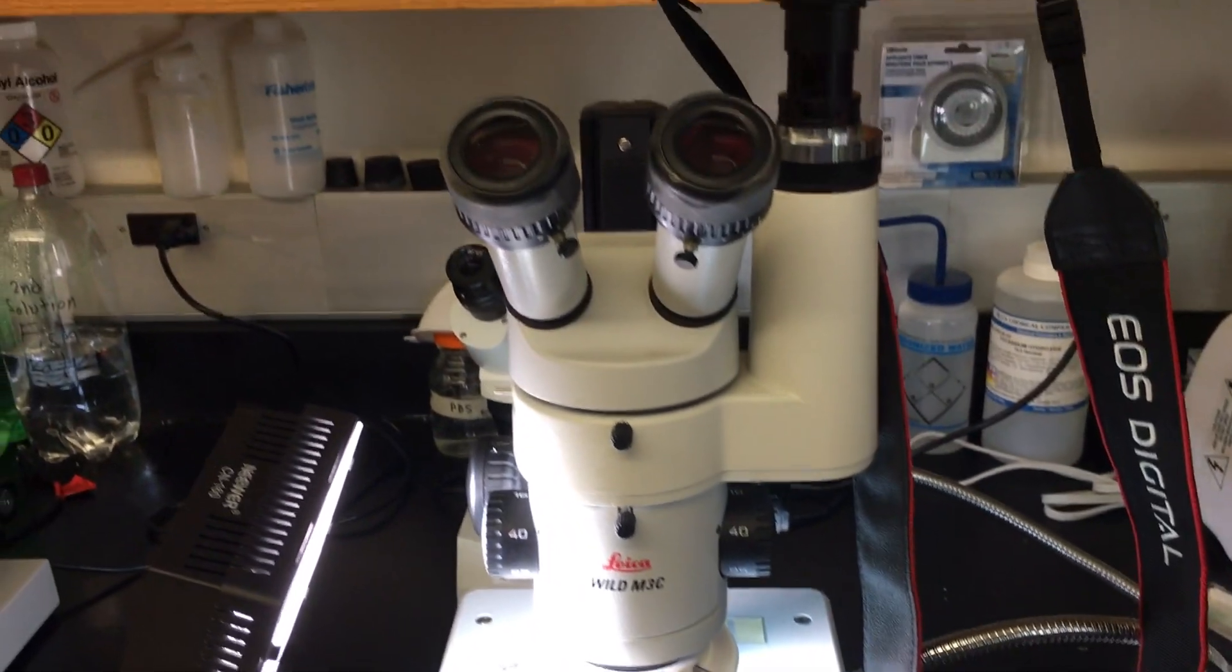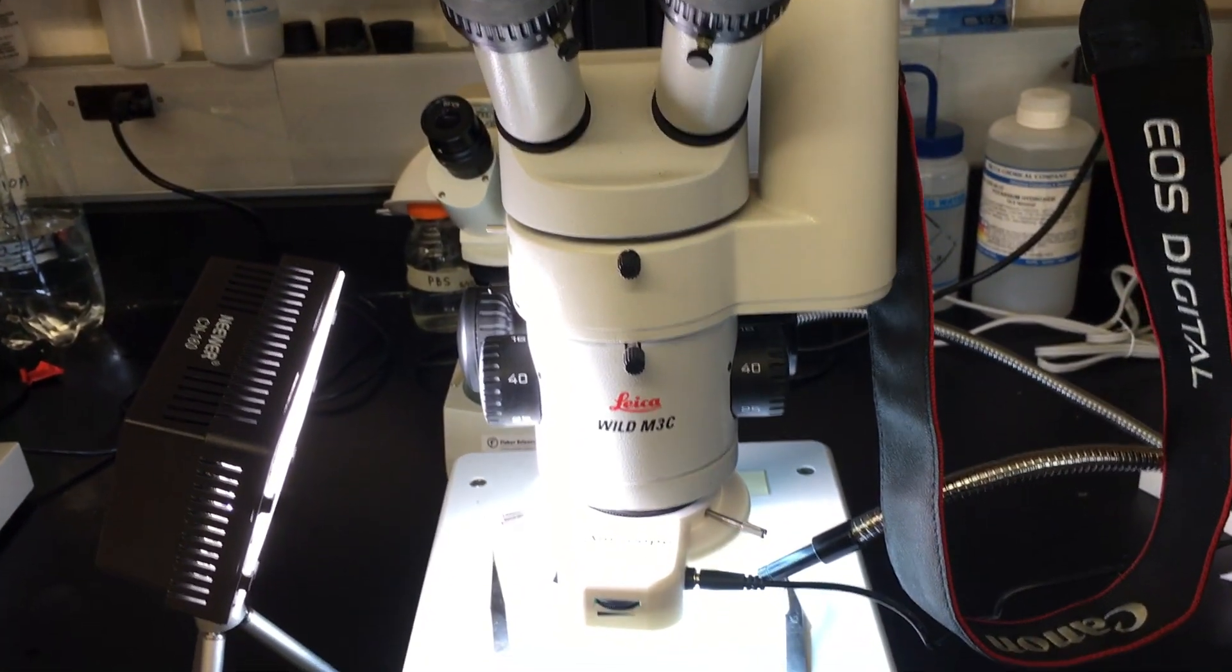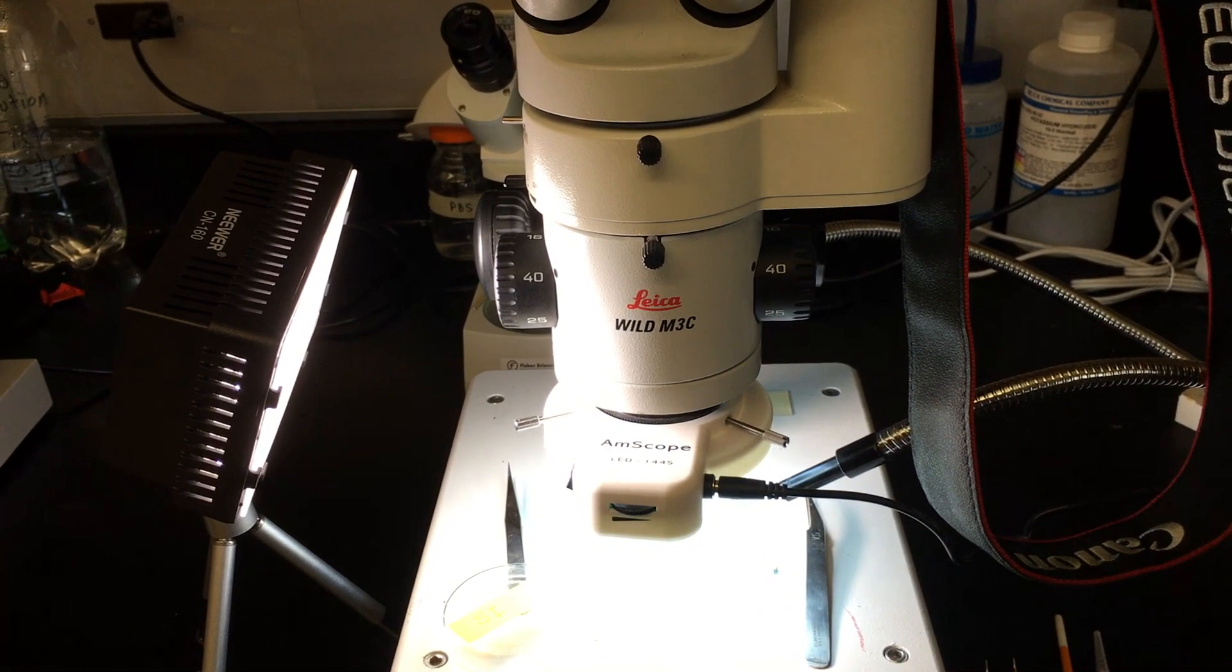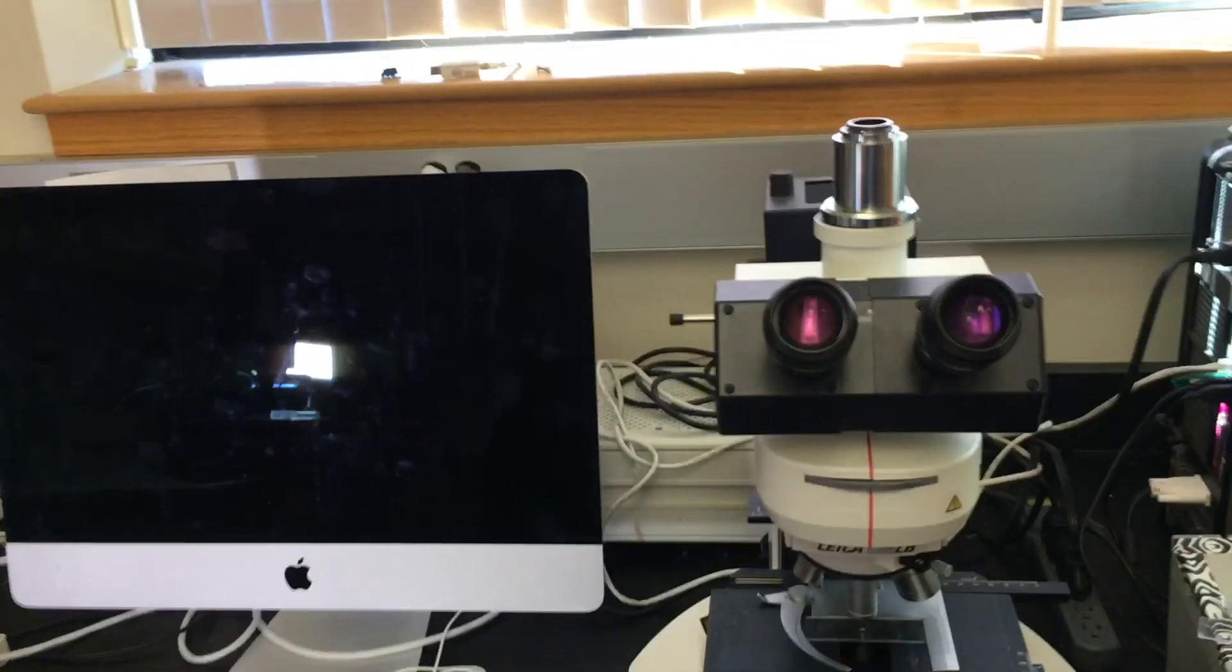This is my little scope, it's good for dissecting work, and it's just a nice general purpose scope. Now let's look over here.